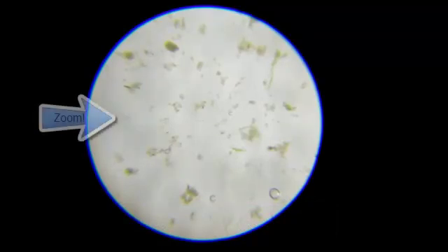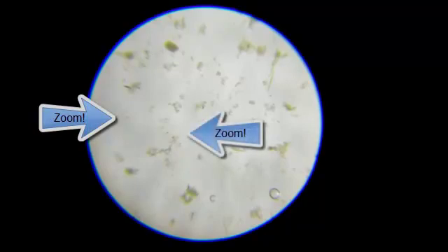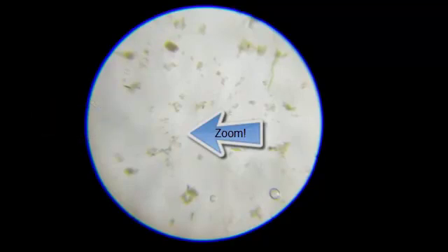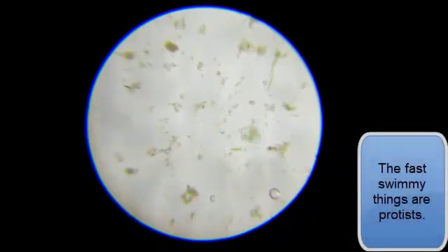So as you're looking, we just saw something moving around on the screen. That is some sort of small organism zooming around inside that water.